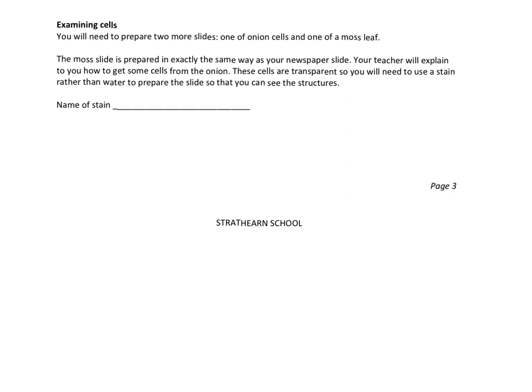So when we come on to this demonstration of preparing a slide of onion cells, we're going to need to use a stain. So just to complete your notes here, but you'll hear it in the video anyway. The name of the stain is called iodine. And if you think about cutting up an onion, it's white. But what we're going to do is peel a really, really thin layer that's actually transparent. And so if we viewed it under a microscope, we wouldn't be able to see any of the parts of the cell. So what we do is we add a couple of drops of a kind of orangey liquid that will stain the cells and allow us to see the different structures within the cells.